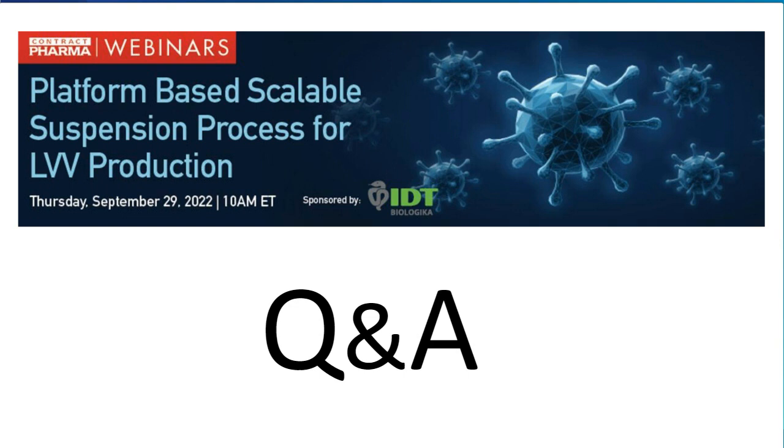Okay, thank you. I've got time for two more before wrapping things up. This attendee would like to know, how do you assay for GMP LVV without GFP? If GFP was not the gene of interest, then the first step would be to find an antibody to target the client-specific gene of interest, if that's available. And if not, then targeting other lentivirus-specific markers is what we would use for the flow cytometry assay.